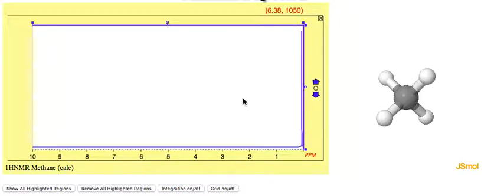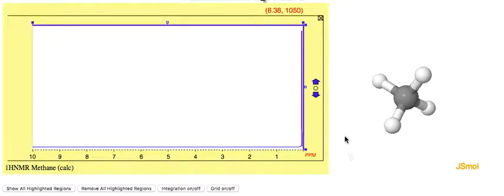Hi, so this video, hopefully shorter than the other, will be showing you spectra and models of the molecules. This spectrum here is for methane, and all four hydrogens are equivalent, and the peak's showing up way down here right next to TMS. The reason is because the carbon only has hydrogens on it. Having another carbon on there actually does tweak things to go downfield a little bit. If I click on the peak, you'll see it's those four, which we knew.